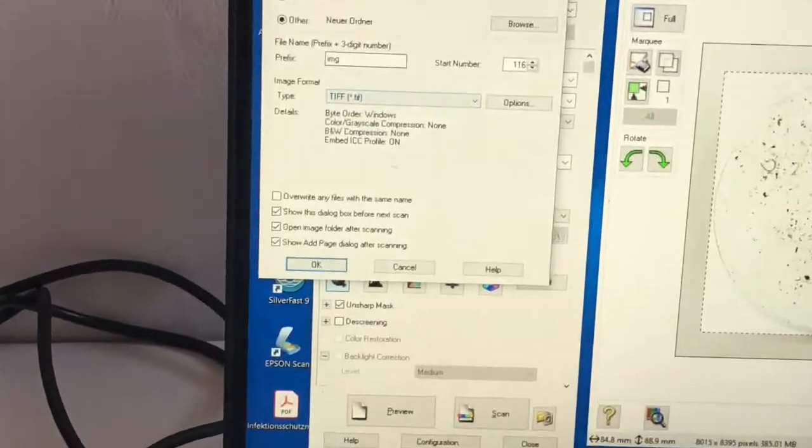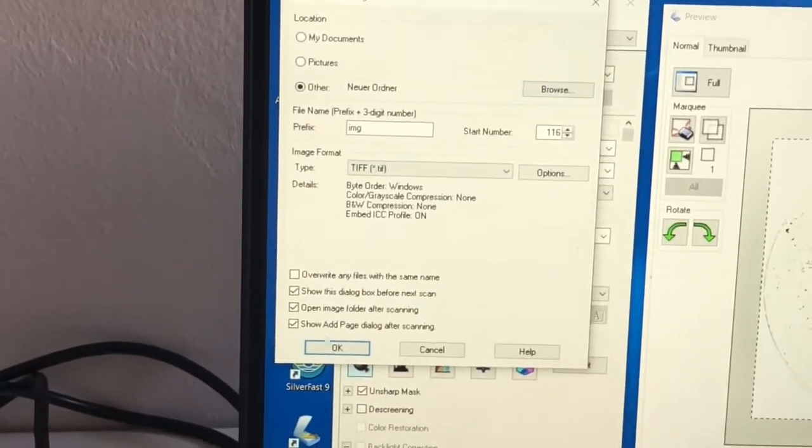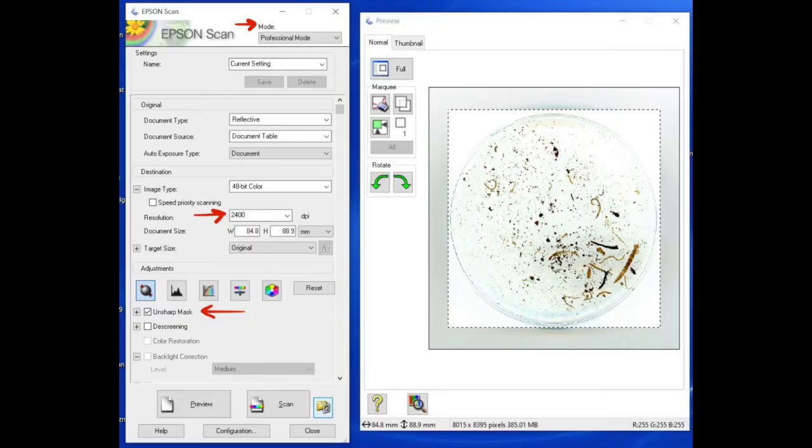Then we set scanner parameters according to the protocol. Please pay attention to the resolution, additional settings, and produce images in JPEG format.